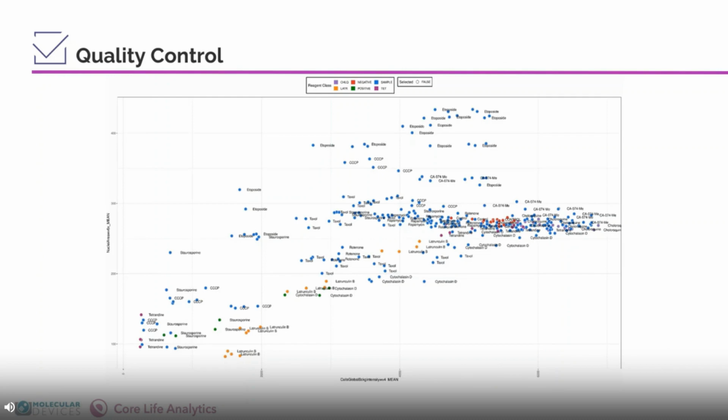And it's important that you are able to see how your data is being distributed based on the various X and Y axes, and interactively to the point where you can select data points and remove some of the obvious outliers, and/or assign a cluster of interesting data points to create new reagent classes or groups. And this is particularly important for a number of reasons, and this all points to one thing: quality control.